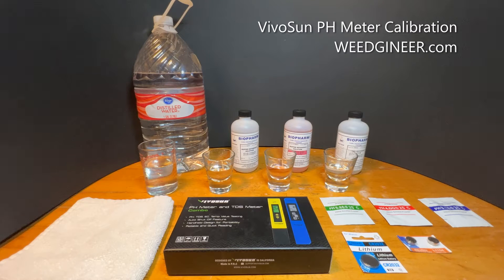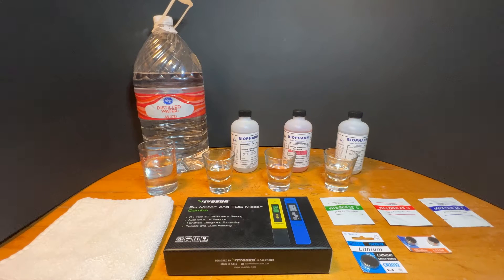WeGineer.com presents the Vivo Sun PH and TDS Meter Kit. We're going to show you how to calibrate it at one point and at three points, plus how to know when it needs to be calibrated again.